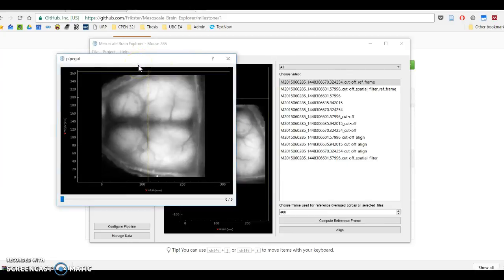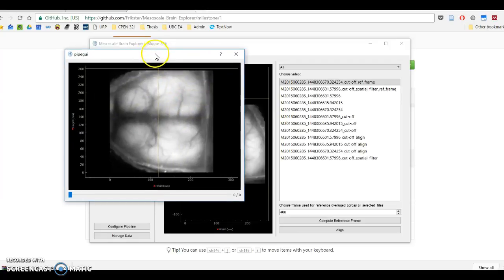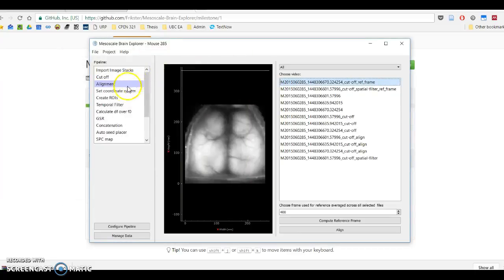Of course, that probably won't be the case for most experiments, especially spontaneous activity from GCaMP6 data. So averaging across it for our purposes is okay, and we'll just go with that because that's what was done in the paper. So that concludes the alignment.